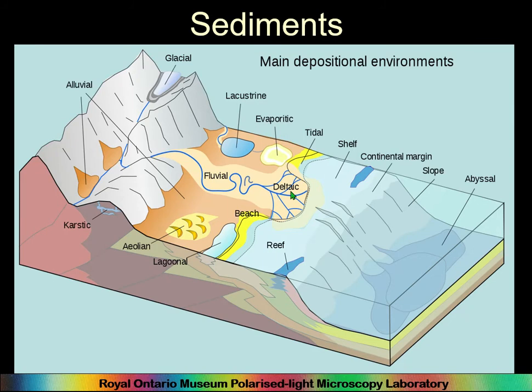So back to this fun diagram. Basically, when it first comes out, you've got a lot of unsorted angularity and all that sort of thing. Things just knocked right out of the rock. And as it gets further down, you get sortedness and roundedness and this sort of thing.